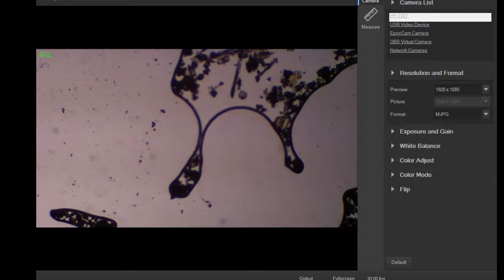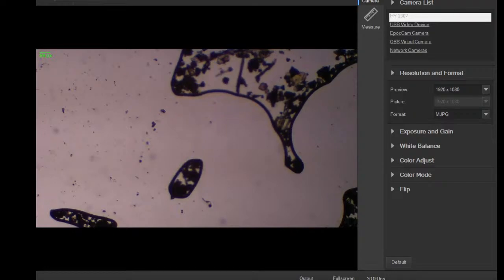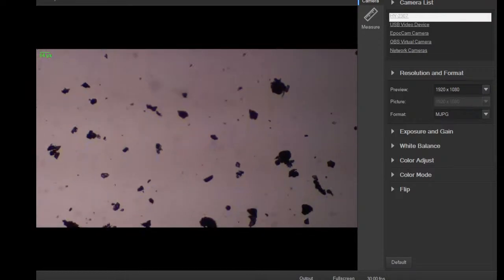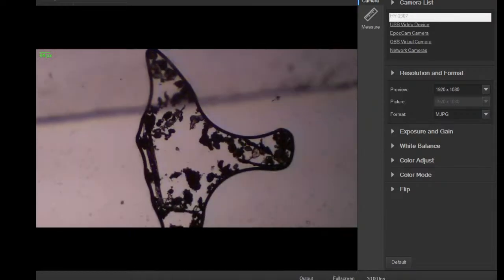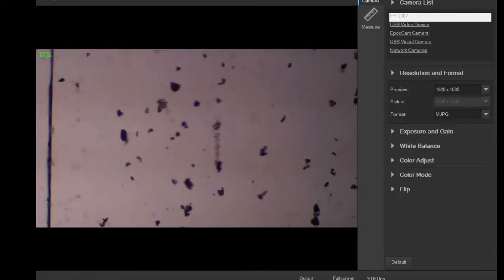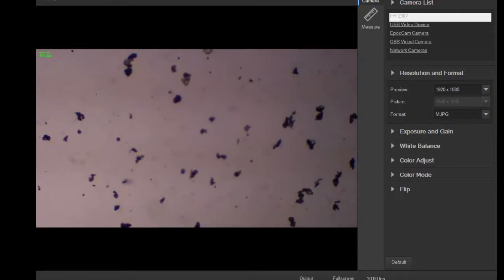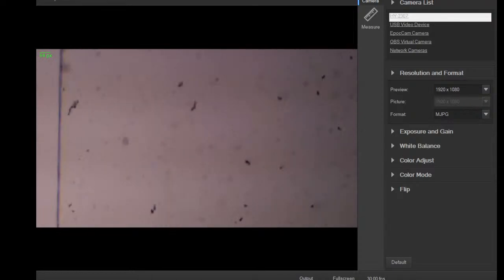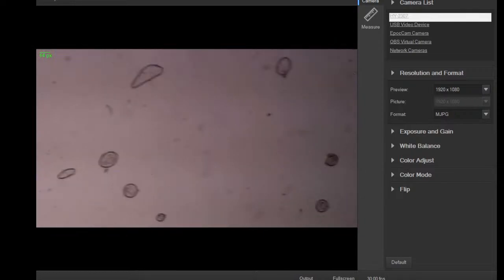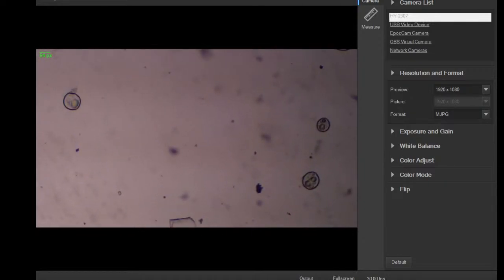Come on, break. It's about to break. Do it. There you go. It's kind of fun. Let's see. Yeah, I made a mess on the cover slip. Little splotches of water everywhere. Let's see what is in the matrix here. Really cool to find an amoeba. But I'll hold my hopes up. That's kind of fun, those little circle shapes, those little air bubbles in there.